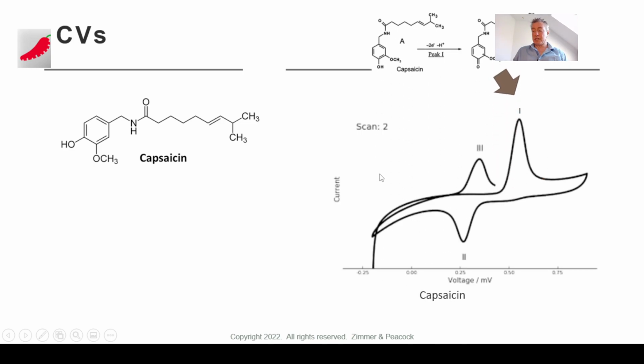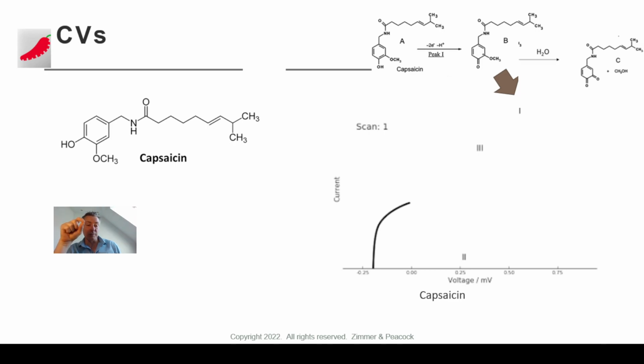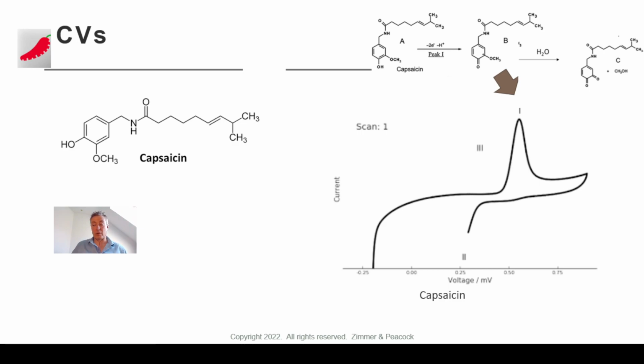Let's jump into this a little bit more. So what's happening in the first peak? What we have is the oxidation of the capsaicin to, I apologize, I'm a chemist, what's called a cation radical. What's not obvious necessarily is that that cation radical is not stable and there's an immediate reaction with water. Electrochemistry is a kind of unusual analytical science: you're analyzing this molecule, but in the process of analyzing it, you're allowing it to go into another chemical reaction. So we have the detection of the molecule in this first peak. We form a cation radical, and then it undergoes a reaction with water, forming a new molecule called a quinone. So this is the quinone molecule.